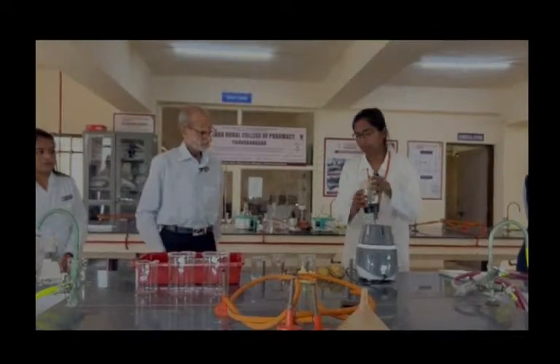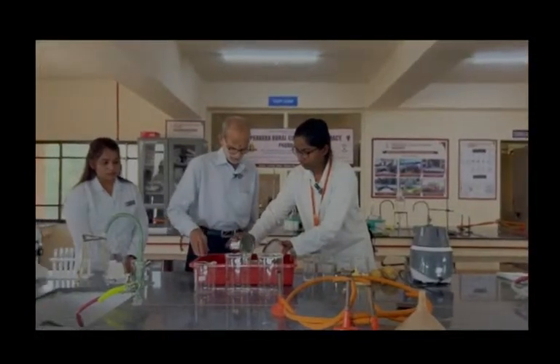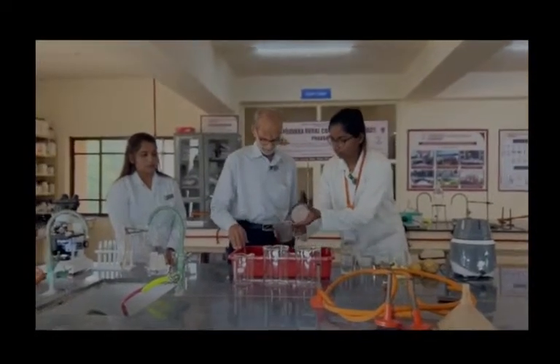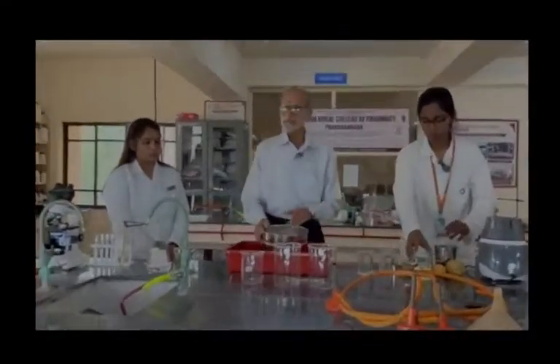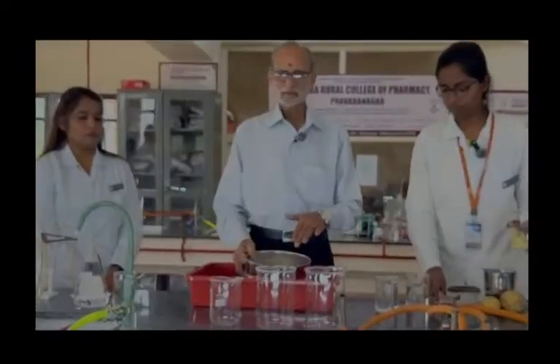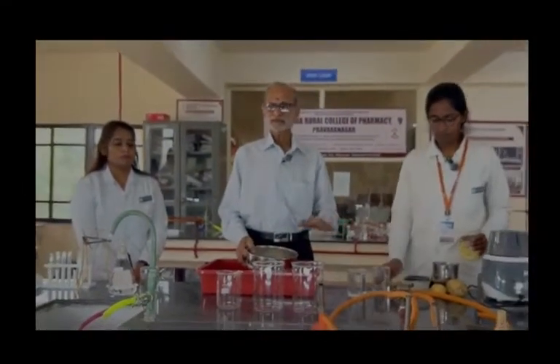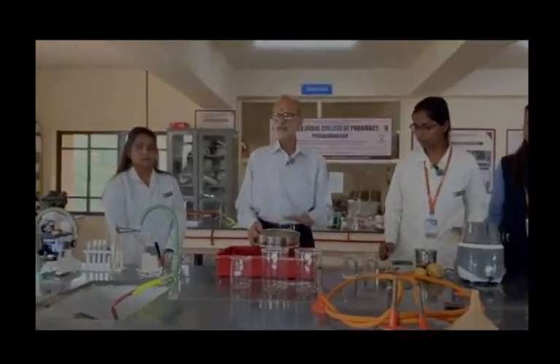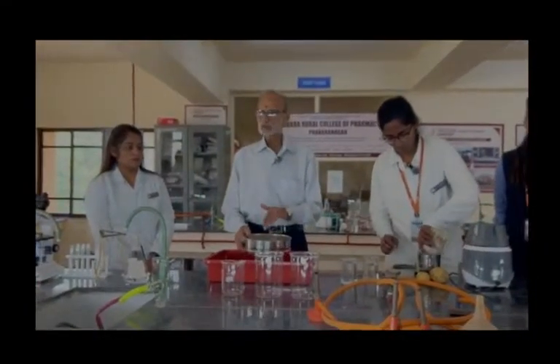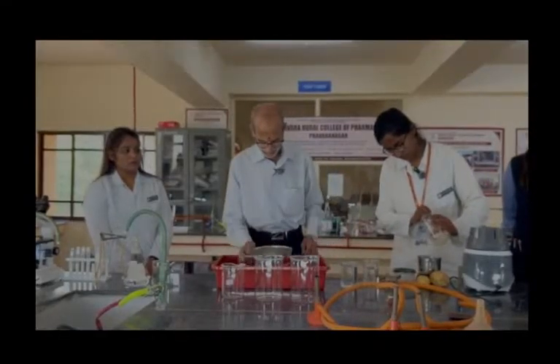Pass it here. Okay, so now you can see here. Anybody knows that it contains starch? Now we have put a little citric acid because potato contains the enzyme peroxidase, and if you don't put citric acid, it will start becoming brown. So it is important, if you want an absolutely white starch, to put a slight amount of citric acid in the cut pieces.